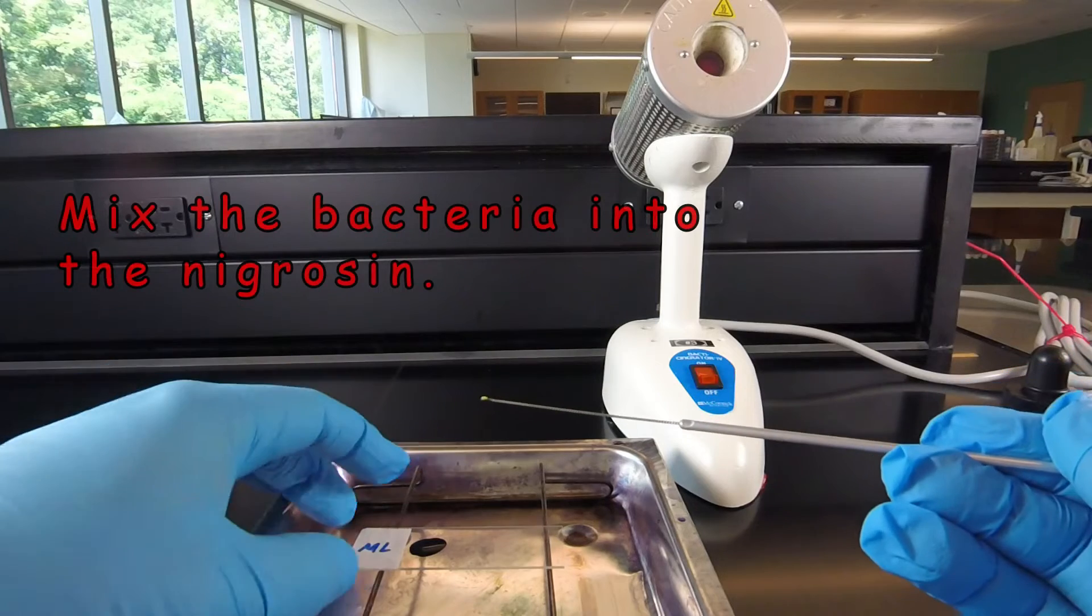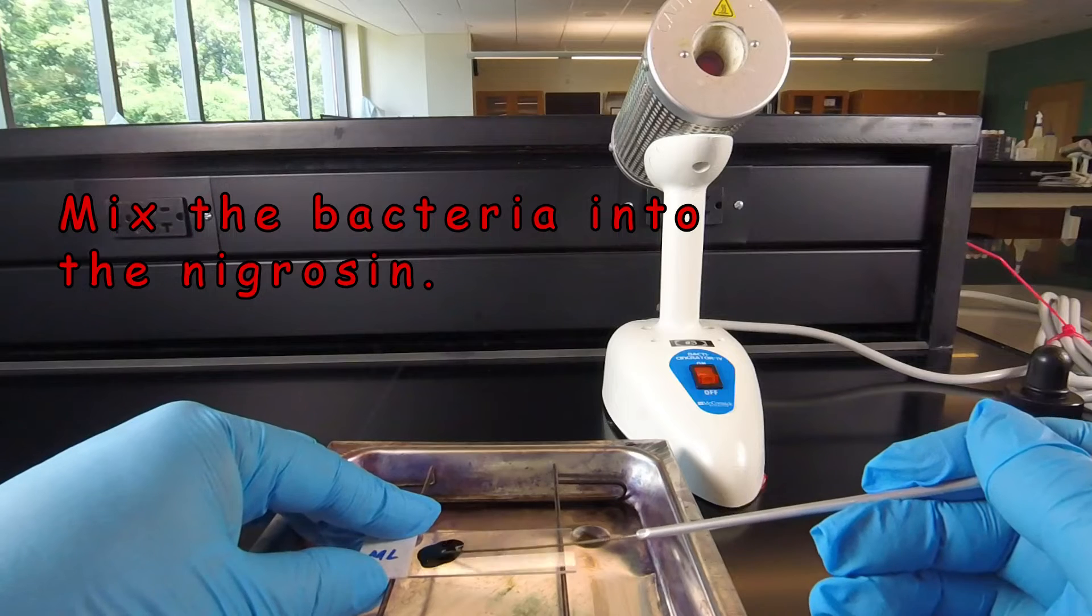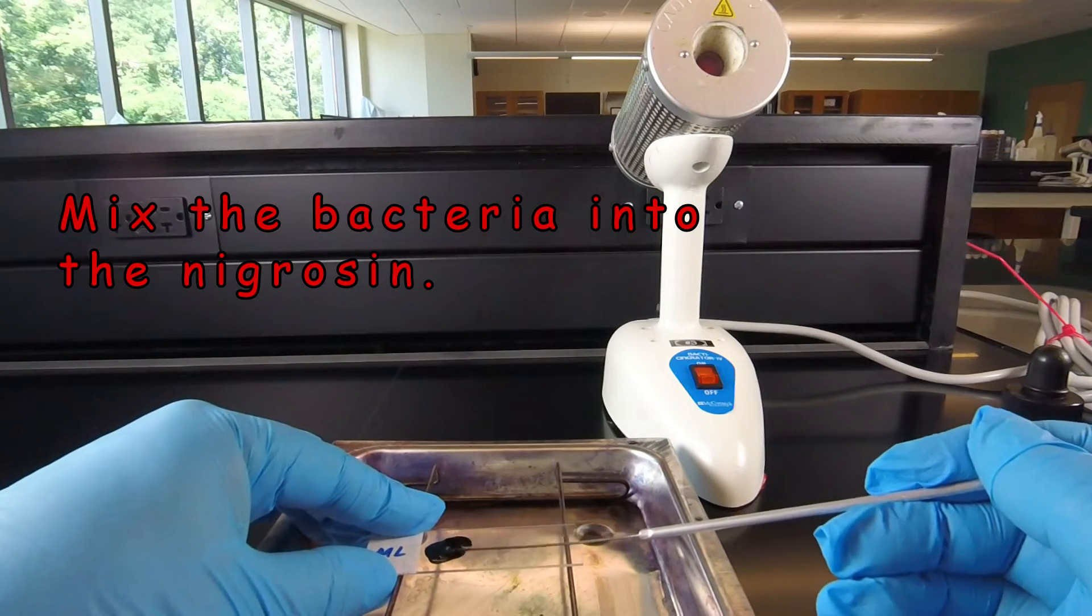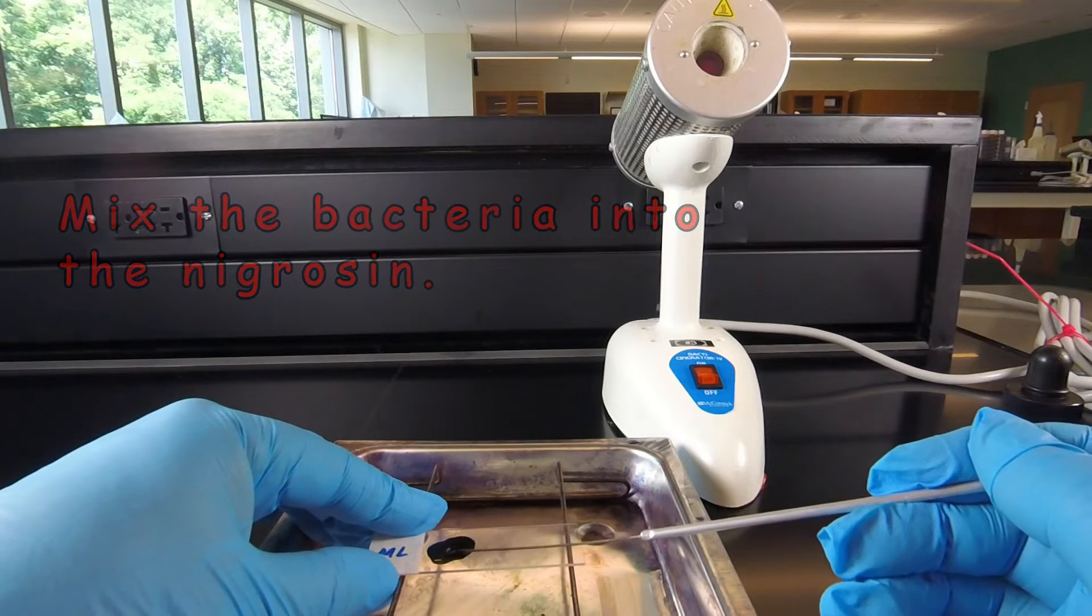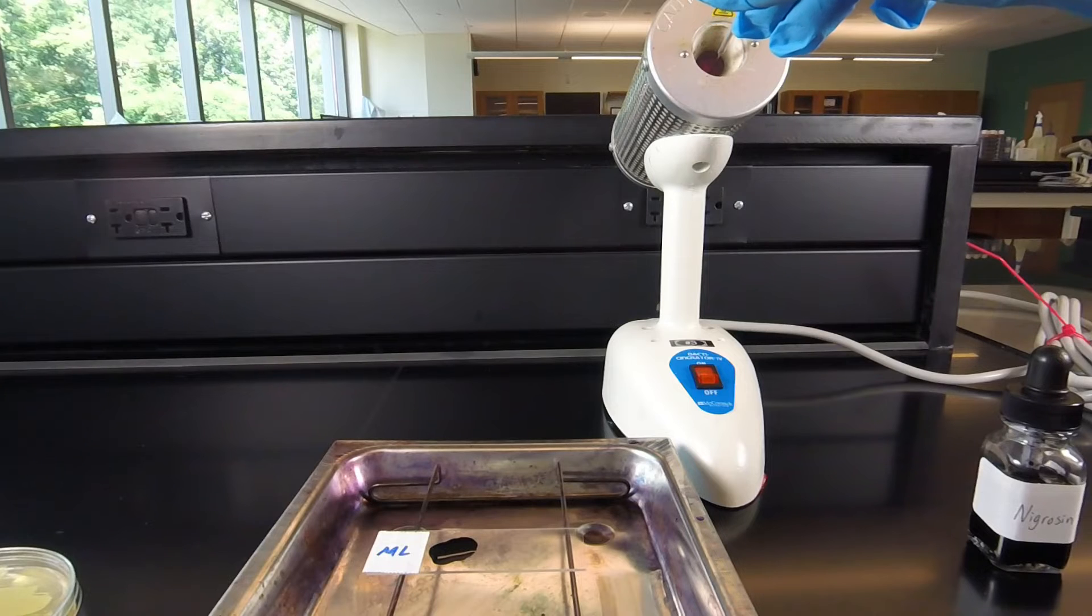Now on the indirect stain, we actually mix the bacteria with the dye itself, smearing it into the dye. Then we can sterilize the inoculating loop to get rid of any bacteria and dye that's on the loop.